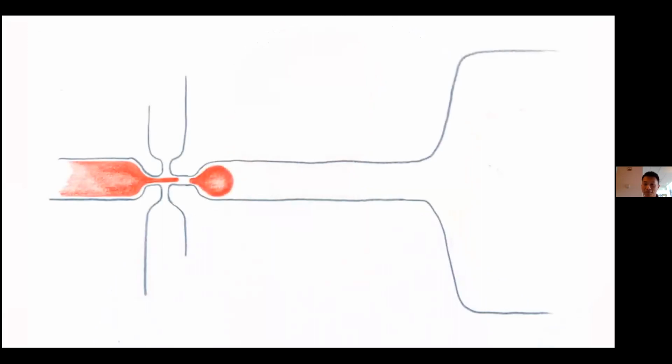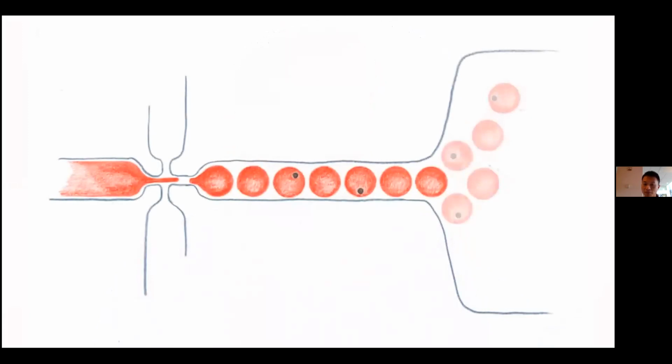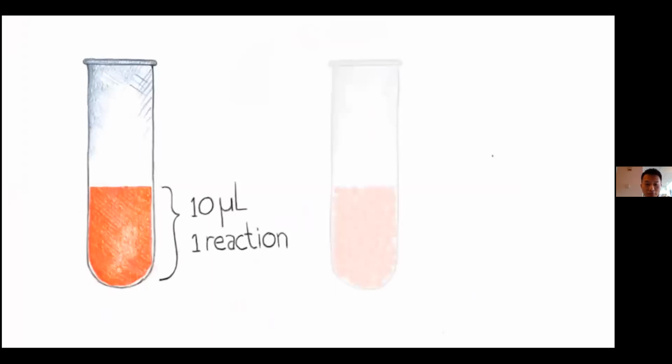We had been using droplets to study many things in molecular biology, such as the expression and copy number variation of individual genes. Droplets provide a way of scaling molecular reactions so that one can perform hundreds of thousands of them in a tiny microcentrifuge tube. What the microfluidic technology brings to the table is really the scalability. We can do around 10,000 to 20,000 cells at every go, and we can really look at complex systems now, like the brain or the immune system.